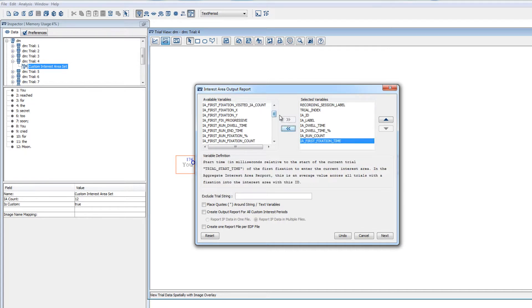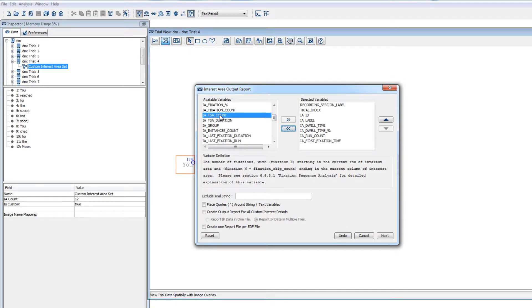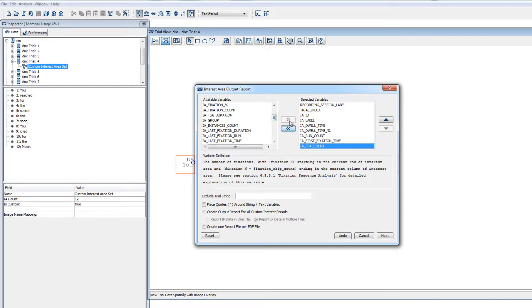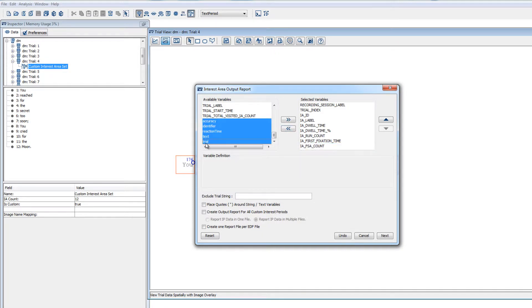For interest area reports, the variables with FSA in the name can be really useful. FSA stands for Fixation Sequence Analysis, and these variables can provide information about the transition of fixations within or across interest areas. And again, the trial variables can be included in the report too.